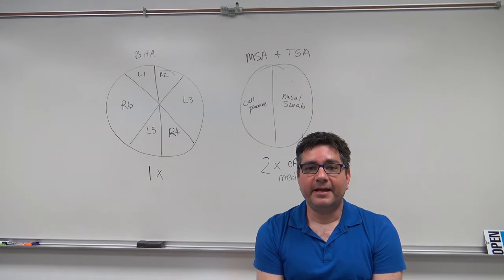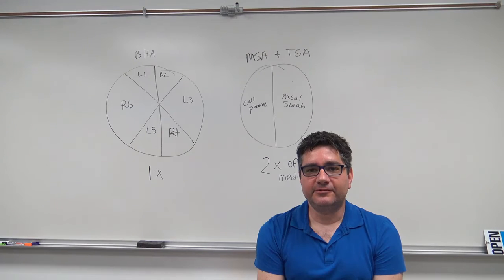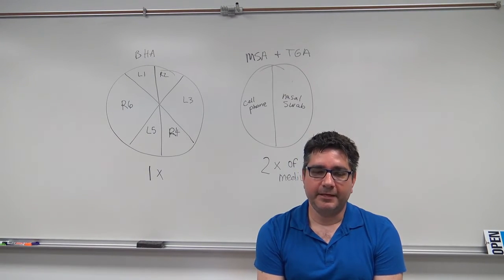Today, you'll be dividing 2 plates in half and streaking a swab sample from your cell phone on one half of the plate and your nasal swab with the other half. Your partner will do the same to their plate. Your TAs will inoculate a plate with Staph epidermidis. After you're done, invert your plate and incubate.